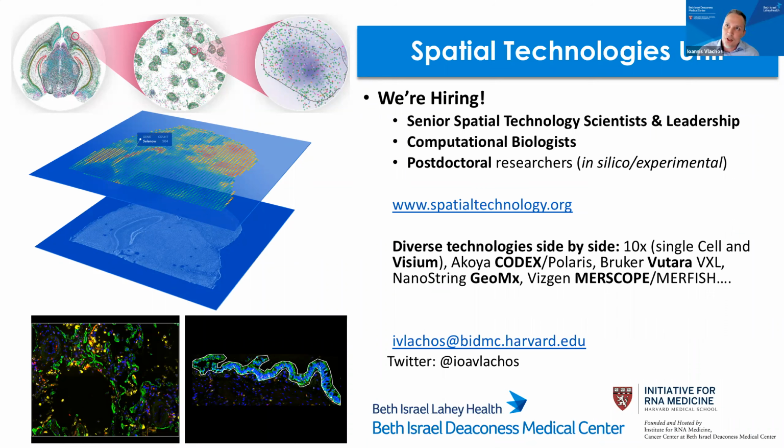So it depends on the technology, and I think you're bringing two important aspects on the same question. So first of all, even if the technologies might seem different or might seem similar, for instance, in the in situ hybridization field, there will be multiple capture rate, accuracy, they will be different, and there is no way to standardize yet, and there is no way to actually quantify. So many things happen. And for us, at least for the WTA, we had to rely a lot on our domain expertise. We happen to work on liver quite a lot, and we have analyzed many public single cell and bulk datasets, and also working with our hepatologists and pathologists. It's very difficult because there is no standardization. There's no way to actually quantify it.